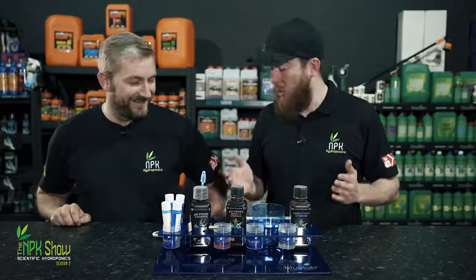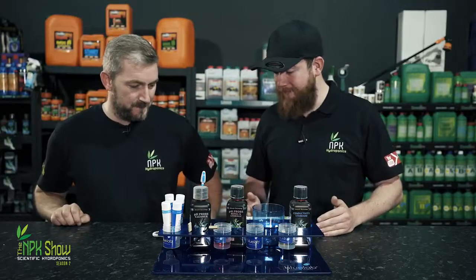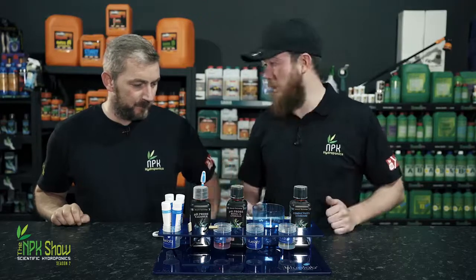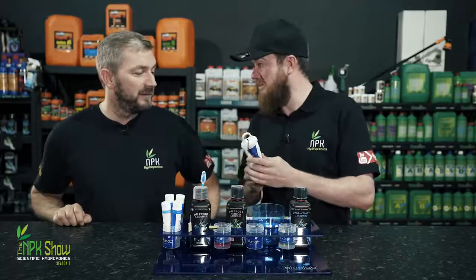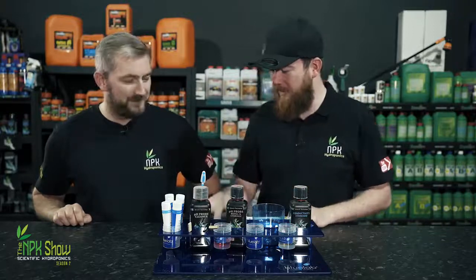Okay, so let's start with pH. First thing with pH, what do you do when you get it out of the box? Have a good look at it, admire it. It's such a nice piece of kit. I like the colours, blue and white, nice and simple. Do you like scientific pieces of equipment? What is the first thing you do when you get a pH pen out?